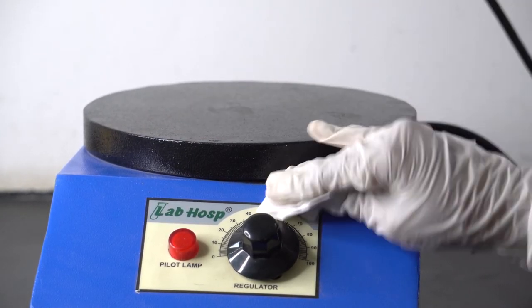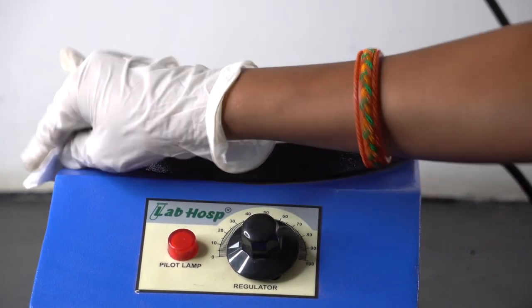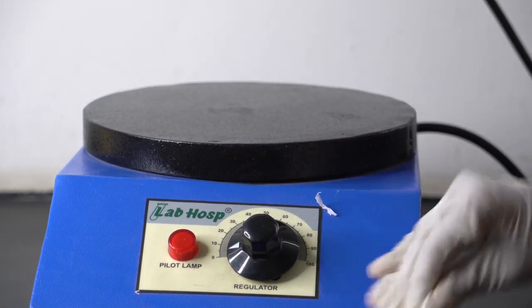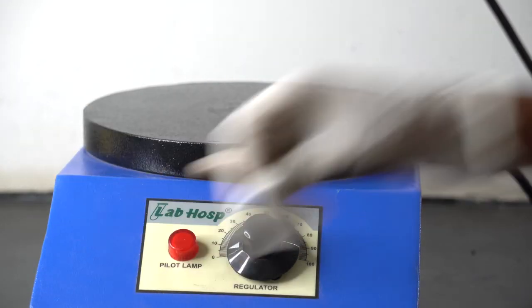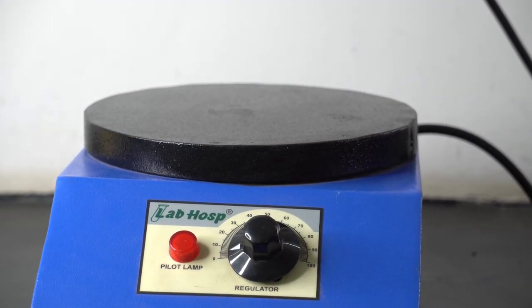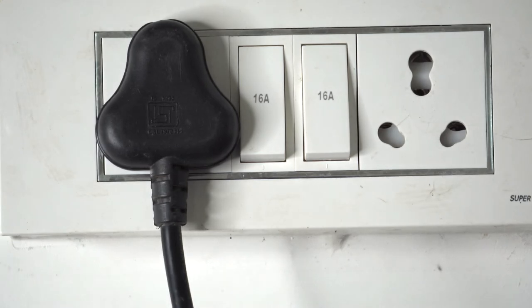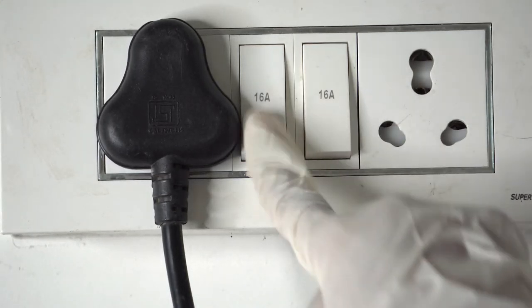Before we begin operation or calibration of the hot plate, we must ensure that the instrument is clean and suitable for use. If not, then clean all parts of the instrument with a clean and dry cloth or tissue paper. After cleaning, switch on the main power supply of the instrument.